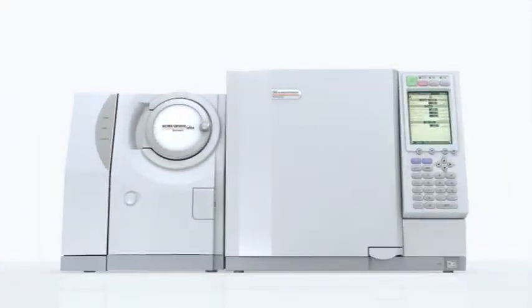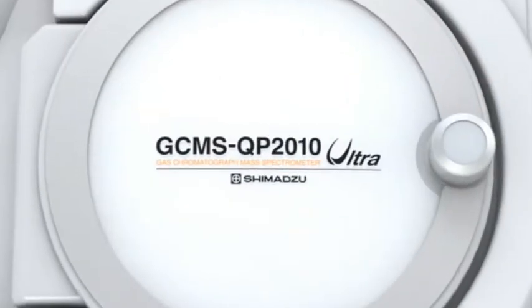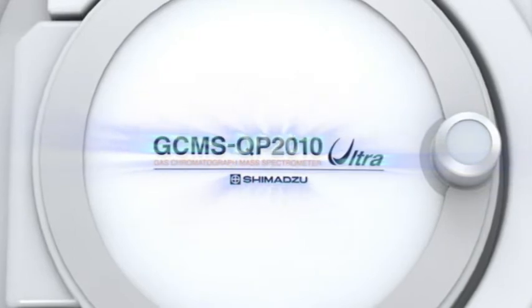Welcome to the GC-MS QP2010 Ultra, Shimadzu's most advanced gas chromatograph mass spectrometer.